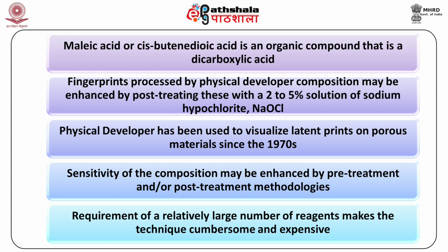Then we have learned that the fingerprints processed by physical developer composition may be enhanced by post-treating these with a 2 to 5% solution of sodium hypochlorite, which is generally known as NaOCl.